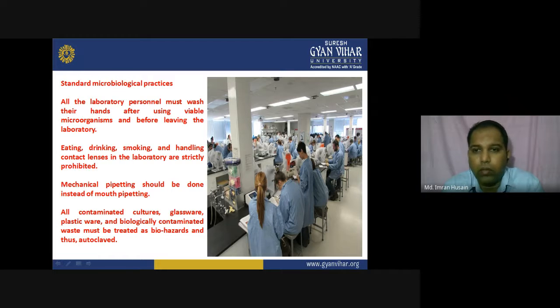Whenever you are discarding anything, when you are washing anything after the crucial experimentation process, you are always supposed to autoclave all the glassware and all the things that have been employed in that particular experiment. After autoclaving, you can proceed further, whether it's discarding that material, discarding the media, or discarding anything, because before autoclaving you are not supposed to discard it into the waste.